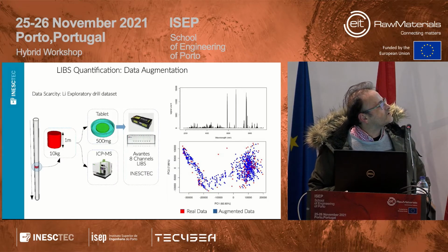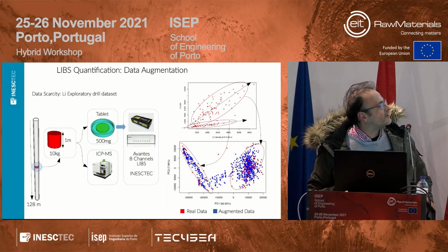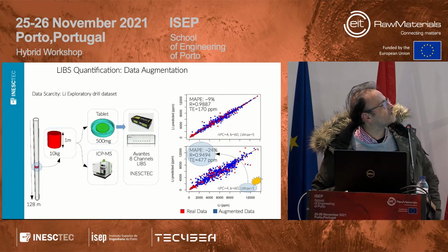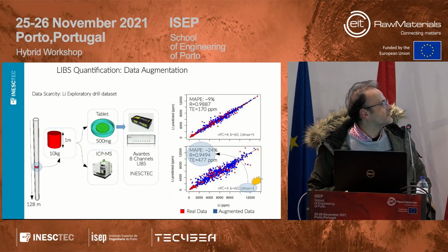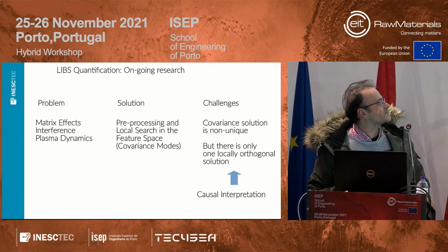Well, if we do this with our laboratory LIBS, then you can see that the augmented data is much more than the real data, and that this data already has some direct correspondence in the two clusters to the lithium line. Of course, lithium lines have high dispersion. But then when we use local models, we have these quantifications. And this begins to be quite good, with very good limits of detection and error percentages.